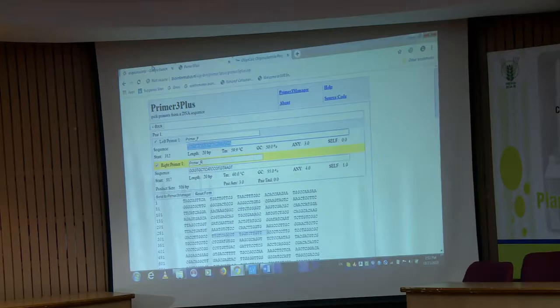So, once you multiple align it, you will come to know the region that is conserved among all the sequences. Please try to design the primer in that particular region. Because if you pick the variable region, then your primer will be specific to that region only. If your organism is that only, then only it will bind and amplify. But if variability is there, then your primer will not bind and proceed further. So, the primer designing should be primarily from the conserved region.